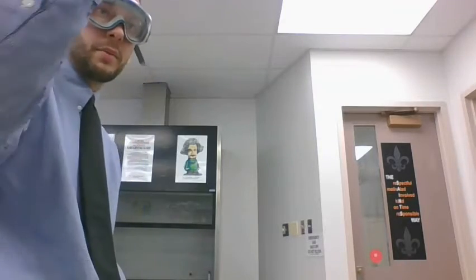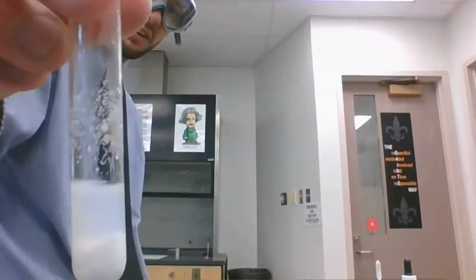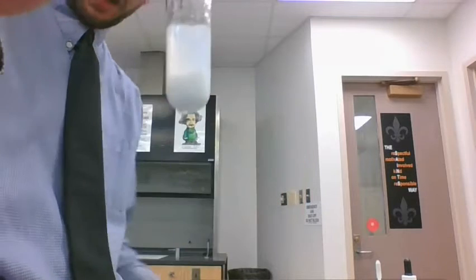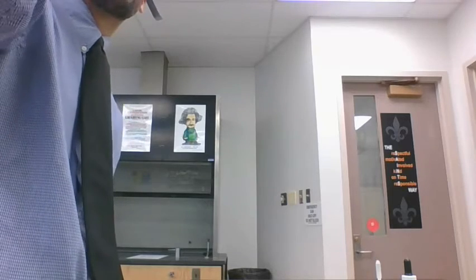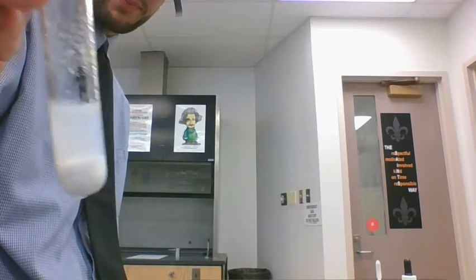Now if we give that a minute to settle out, you can see right about here and down below is a white solid settling out, and the top part is becoming a little bit clearer, maybe that's the water that was in there on top.